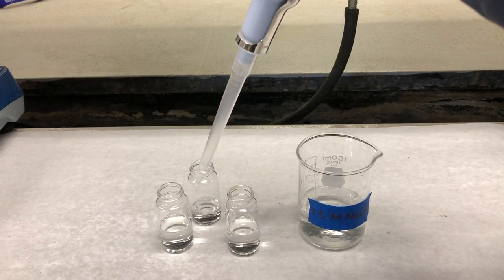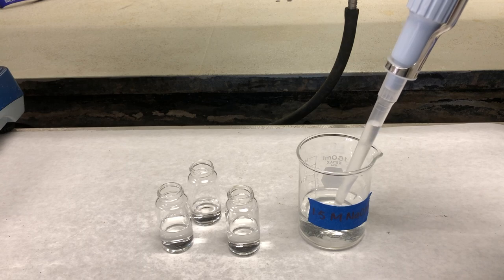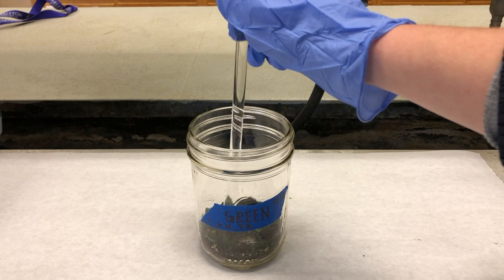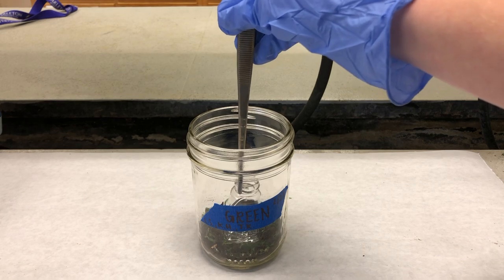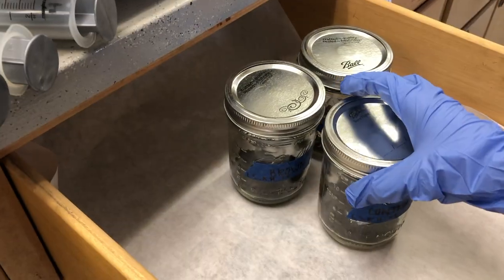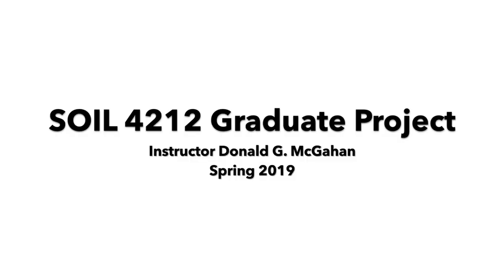Next, use a pipette or repipetter to add exactly 10 milliliters of sodium hydroxide to each of the three glass vials. Using a stirring rod, make a small space in the center of the soil and carefully add one scintillation vial to each jar. Ensure that no sodium hydroxide spills onto the soil. Then tightly close each jar and store the jars in a dark space to incubate until part two of the procedure is to be conducted.